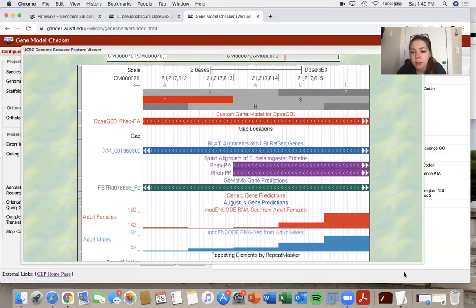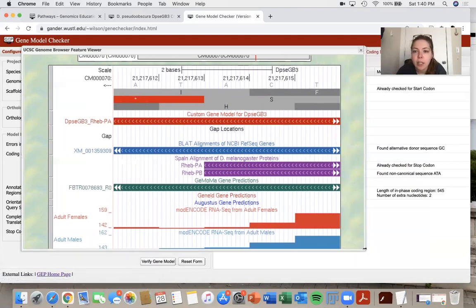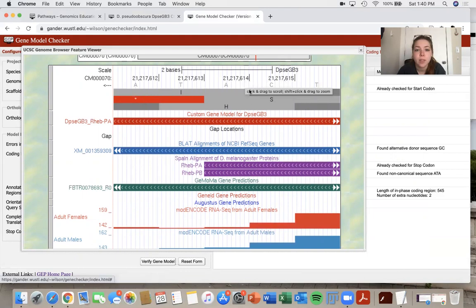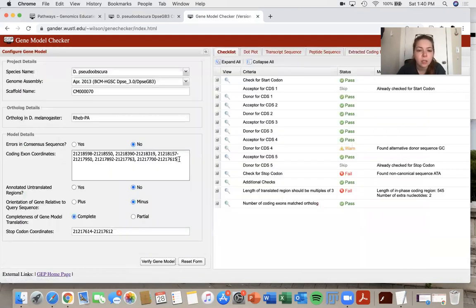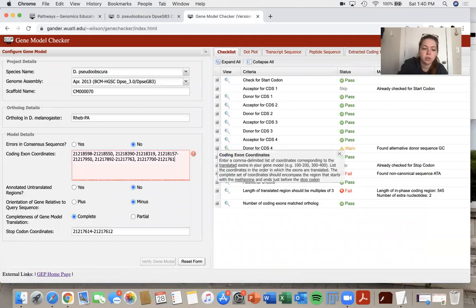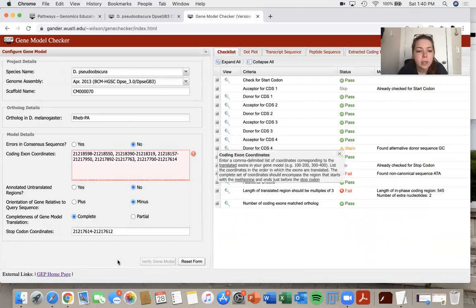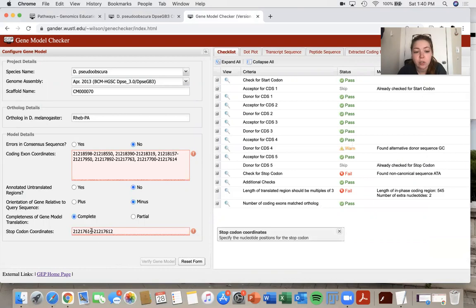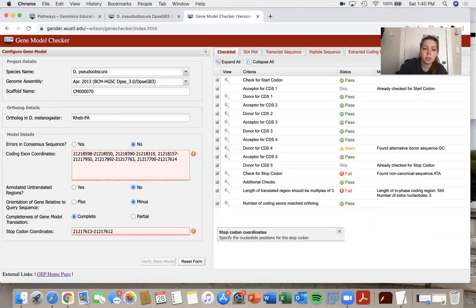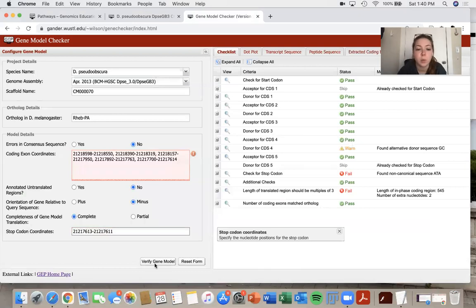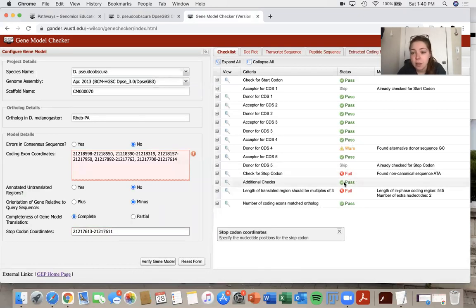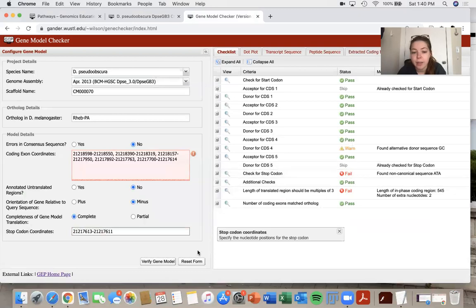So that was just a simple mistake. So I can go back into the gene model checker and change that out for two, one, five to two, one, four, because that's the last base before the stop codon starts. If I change that to two, one, four, then I also need to change my stop codon coordinates. So then that would shift over to six, one, three to six, one, one. So now if I verify, I'm hoping to see this change to a pass.